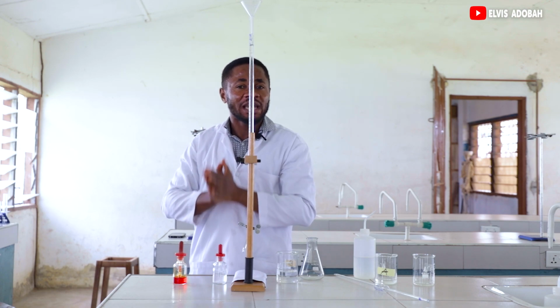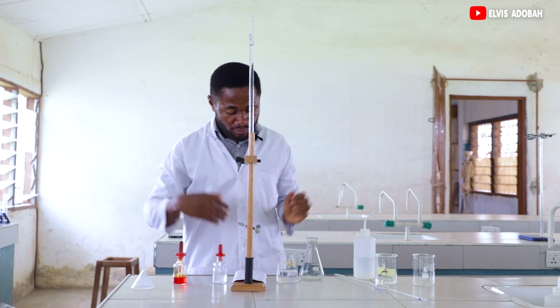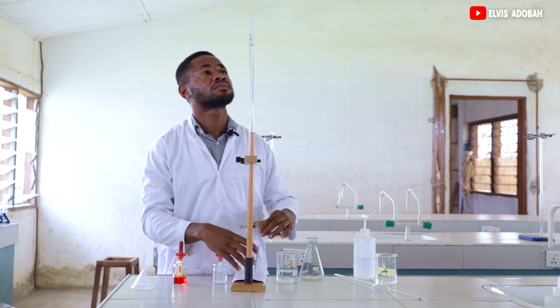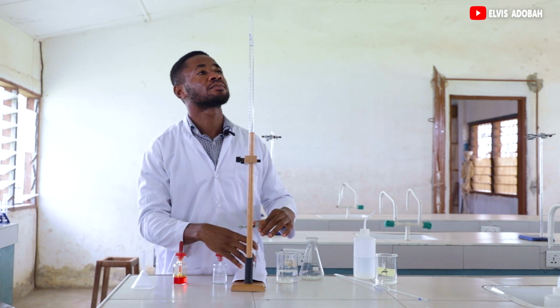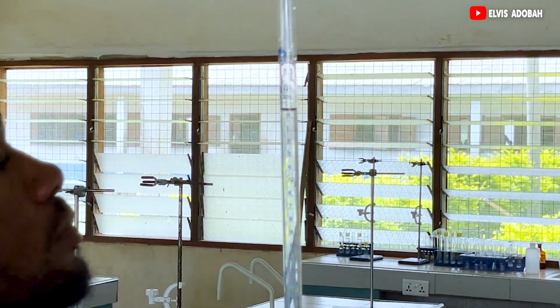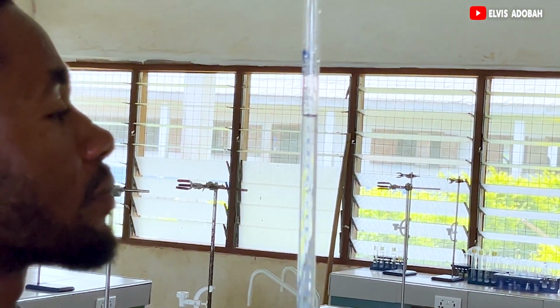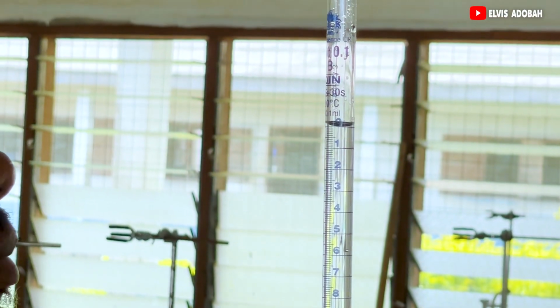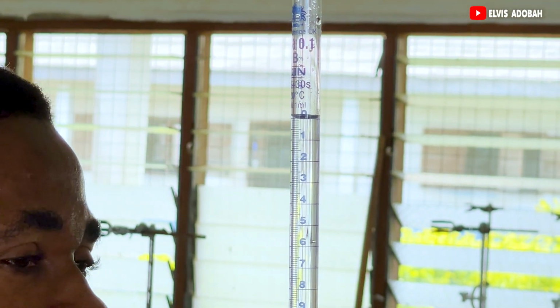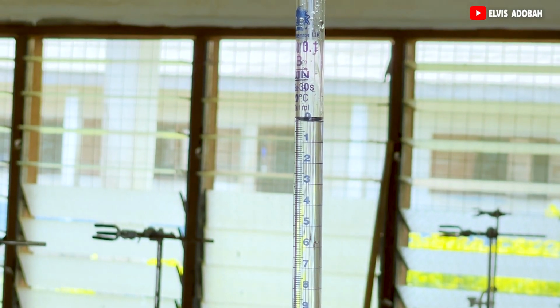So quantity is priority over here. So we adjust until the bottom of the meniscus sits on the 0th mark. Now that 0 is going to be our initial volume of acid.